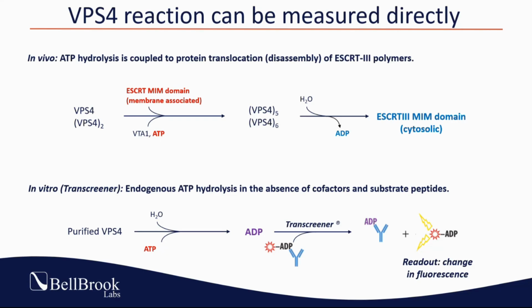Now, in-house, when we've built our Transcreener ADP² assay around this activity, we target only the ADP generating capacity of this enzyme. And consistent with the goals of a lot of pharmacological interests, we are looking to characterize the ATPase activity so that we can then screen for ATP competitive inhibitors.